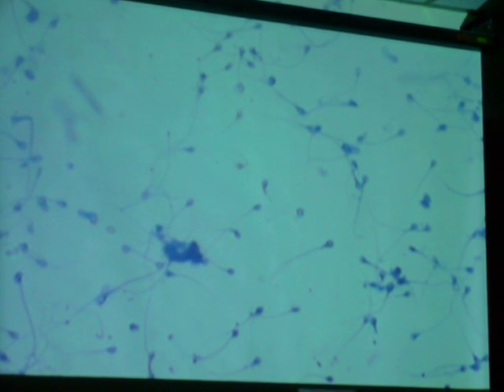Yeah, I like this microscope better. So these are all sperm here. Sperm head and then the flagellum coming off. And that's the part we see, that flagellum is the part we see in the lumen of that seminiferous tubule.